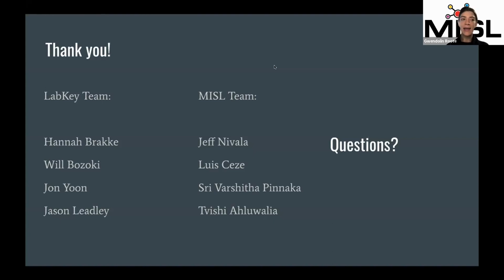And I think just asking the people in my lab to just go watch that training wasn't as effective as I hoped it would be. So kind of distilling it and making the training mechanism personal really has been helping a lot with getting people to adopt this work. And for other questions, I'm happy to answer them over the chat.